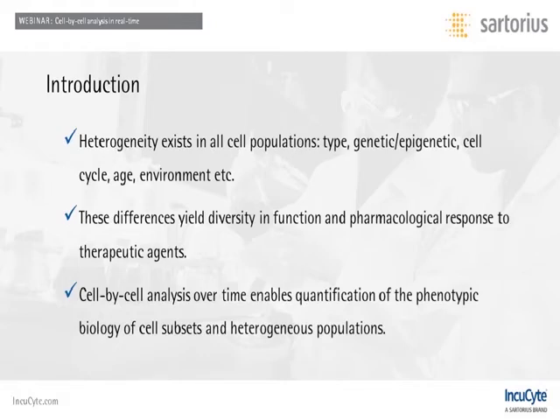Cell heterogeneity is always present to some extent within any cell population, be it cell type or function, where a cell is in its cell cycle, as well as differences at the biochemical or genetic level. Seemingly identical cells can differ greatly in their response to changes in environment, and these differences can have important consequences for both health and function of the entire population.